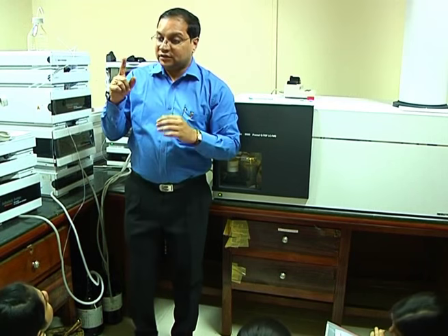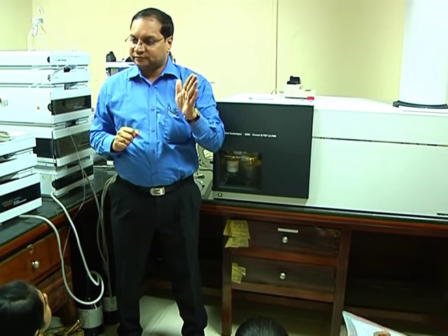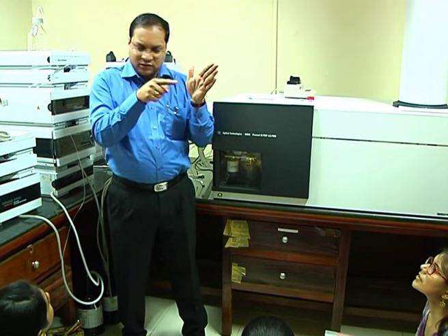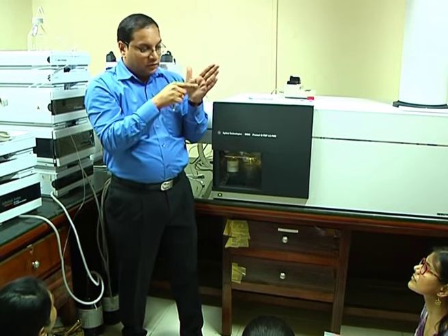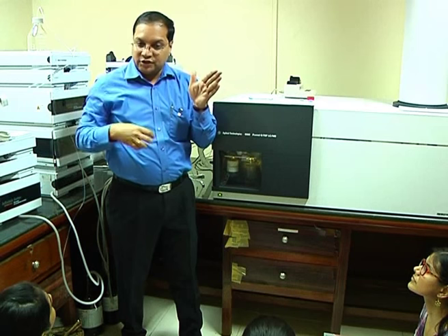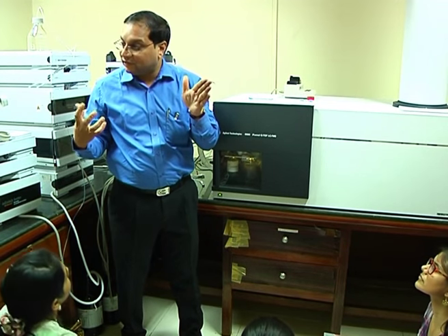In data dependent acquisition, this same scan time is split into two different experiments. Experiment 1: scan first, let everything go into the TOF, and in this scan pick up the precursors based on the decision engine, depending upon the data which is coming.